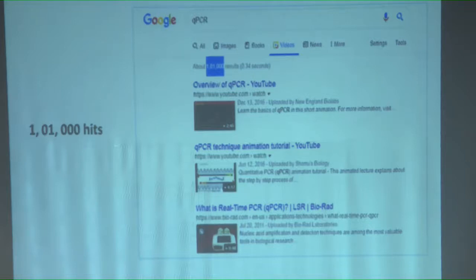I'll try to explain what is really underneath in Qpcr. Since PCR has become a kind of routine tool and protocol in biology research, there is a great deal that needs to be spoken about Qpcr, especially to this young audience. So the substantial part of my lecture is on Qpcr, but nevertheless, PCR will come time and again in the discussion. These are all the acronyms.